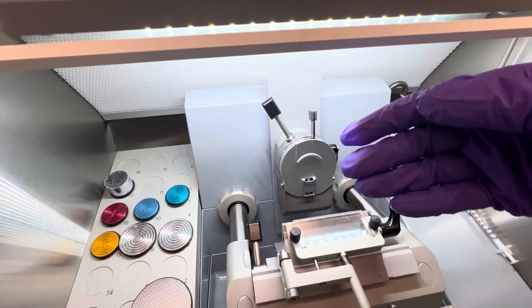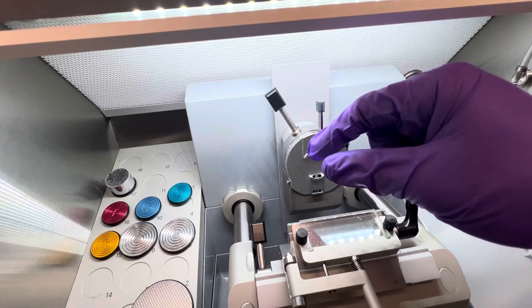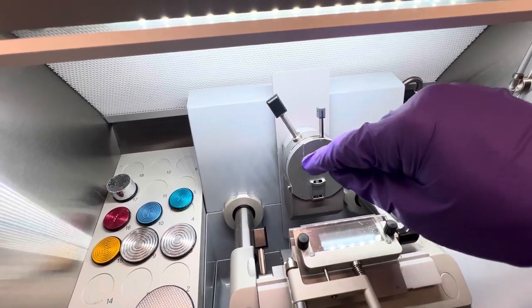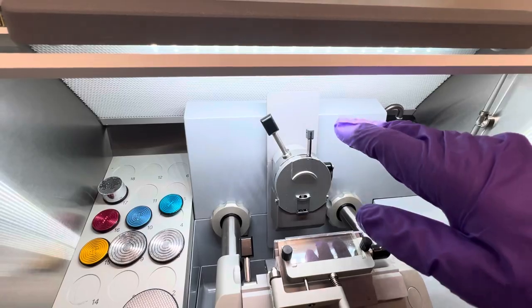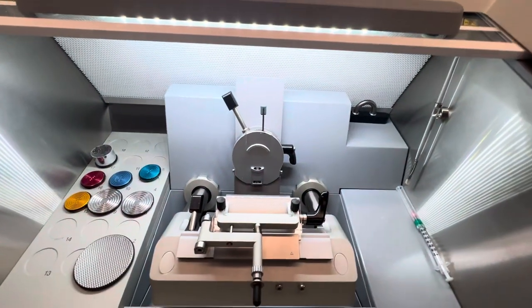It's not necessarily ice, but that's what it looks like. In the frozen OCT, you'll be able to see the shadow, kind of like a coloration coming through. It gets more obvious the more you do it, but just be very careful. As soon as you see that, you want to start switching to the fine and taking sections like that.